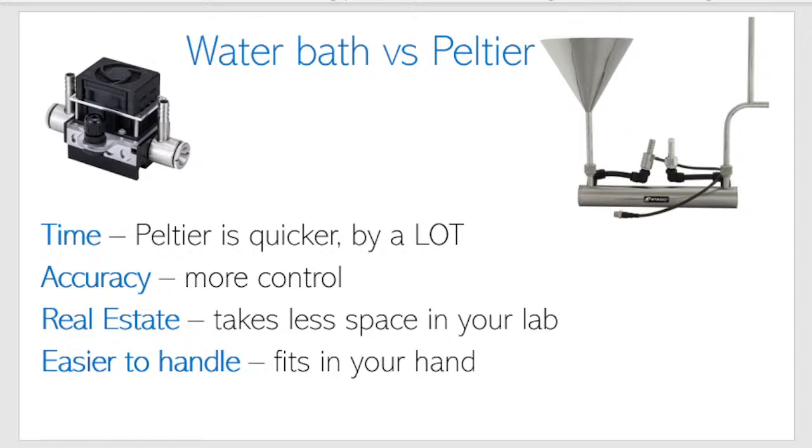So you connect this device to a water bath, and on one point of the nozzle the water goes in, circulates around your sample, and then goes back out to the water bath. And that is how temperature is controlled. That is what used to be the traditional way.